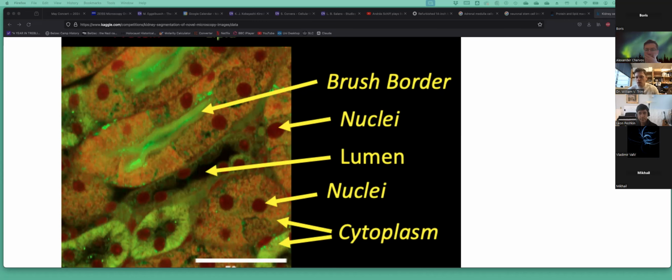Well, this sounds like a reasoning model, some kind of reasoning. Once you're able to parse this image, I will do the reasoning, right? I would just ask you to export all of the objects from each new image, parsed according to the model, and then I could do statistics. I'm not asking you to build a large language model for me. Okay, I'm trying to understand. We have to segment it in multiple layers. In each layer we can do clustering and make some predictions or analysis, and somehow aggregate the data. All right? Yes.